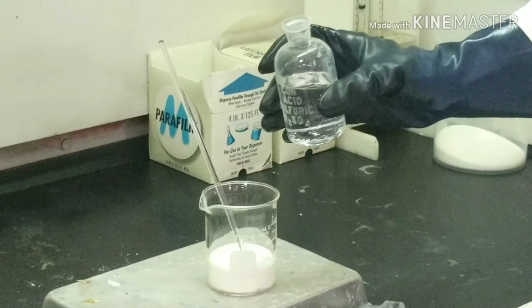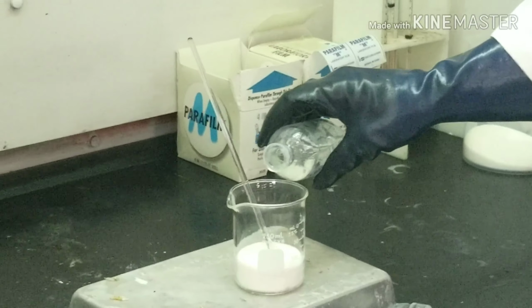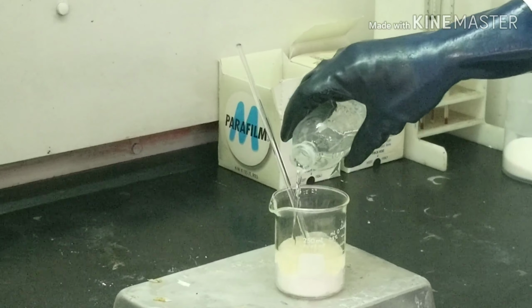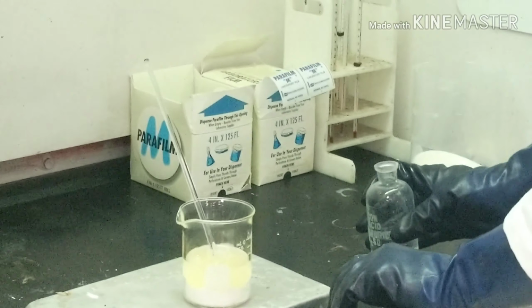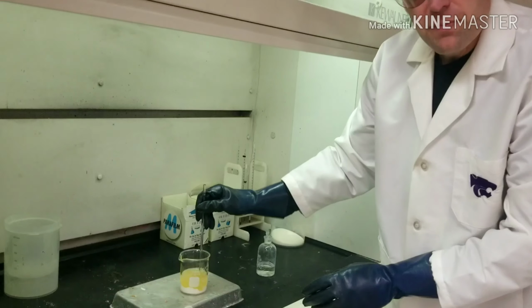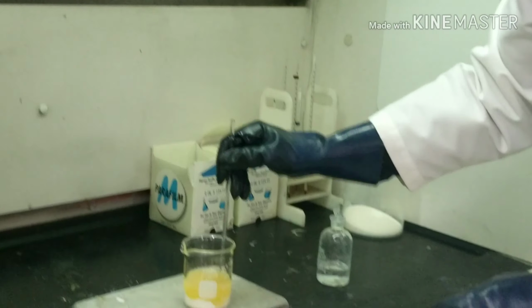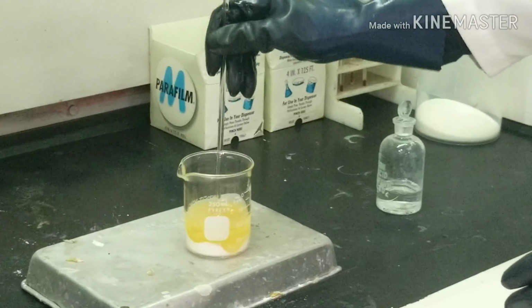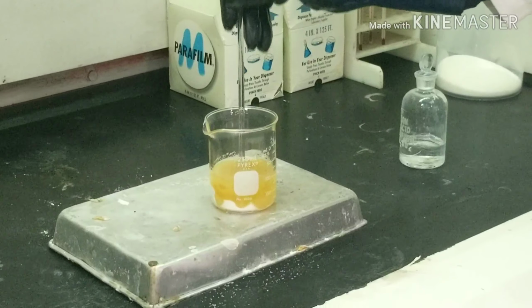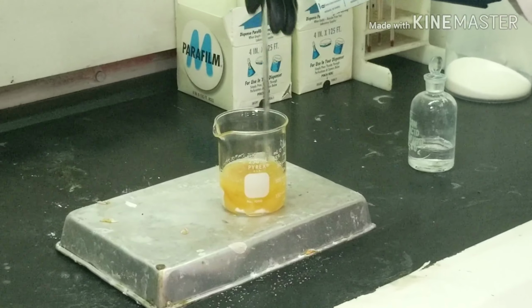So again, the H2SO4, concentrated sulfuric acid. Make sure it's mixed up a little bit here. That sulfuric acid gets mixed down to the bottom parts of the sugar.